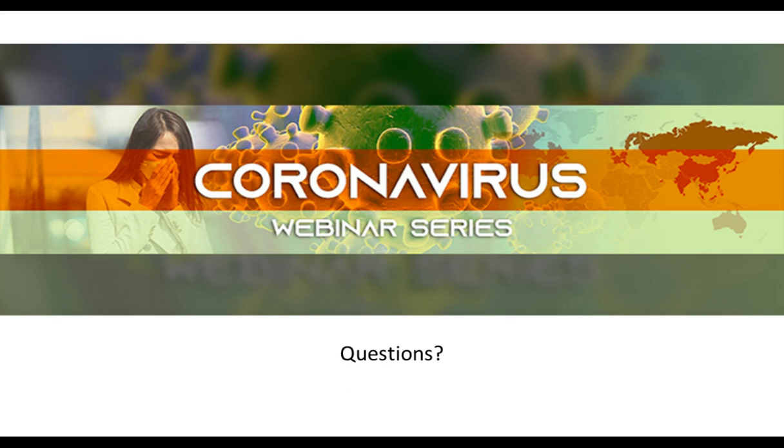Wonderful, thank you. And I'll switch back and forth. Pan, here's a question for you. Does your test use TaqMan technology with primers and probe or other technologies? Yes, our kit is actually using TaqMan technology.